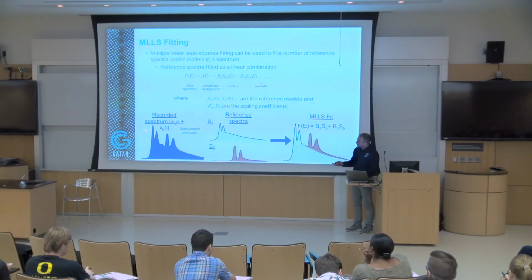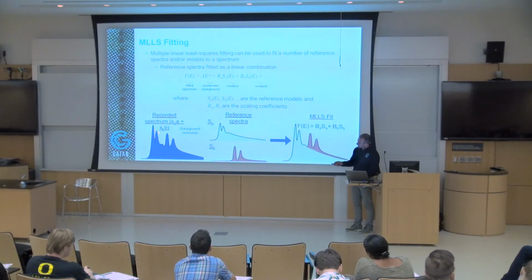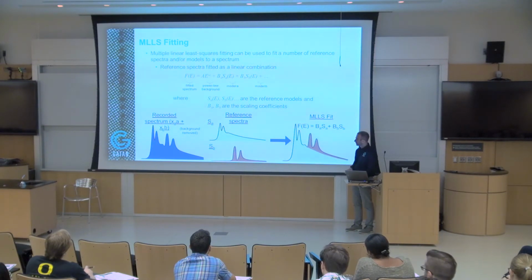So you can easily extract the intensity from component A. You can just put a very narrow integrating energy window here. But what about component B? You don't have enough space to fit the background. So this spectrum is actually made of two components, component A and component B.